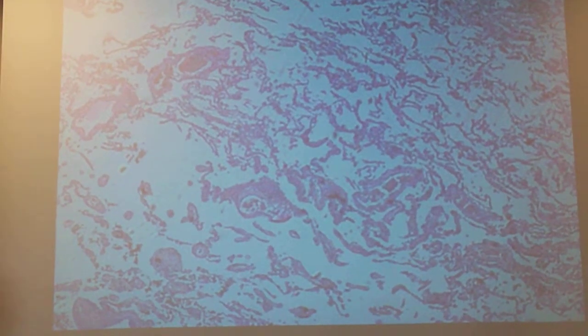The alveolus and the bronchial. Bronchial. Okay, that's nice.